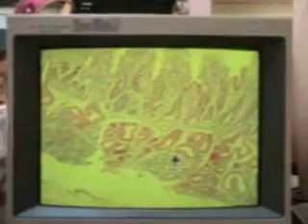We don't have it, but okay, so this is the gastric region, and we move down to a good part of the duodenum where you actually can see the villi. Here the villi are much more prominent in this area, and you also see the submucosal gland, and again lymphoid infiltrate. So let me go to this region and enlarge it.